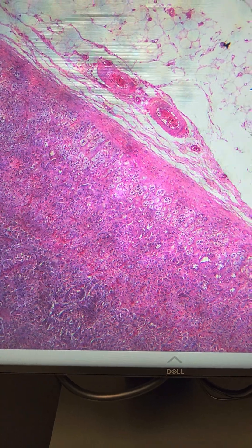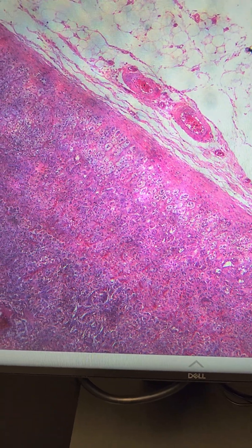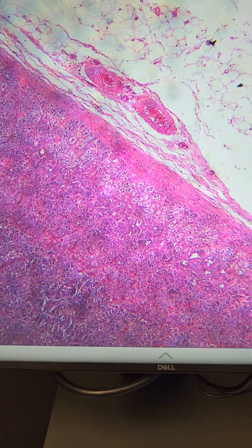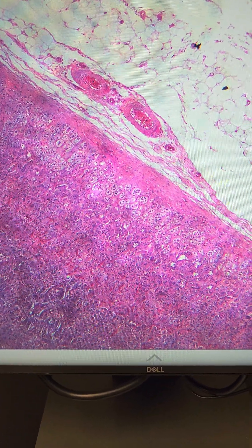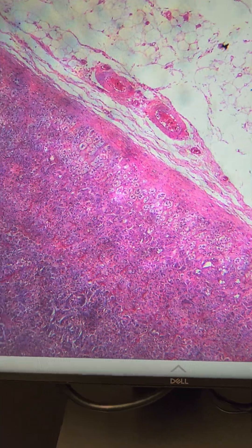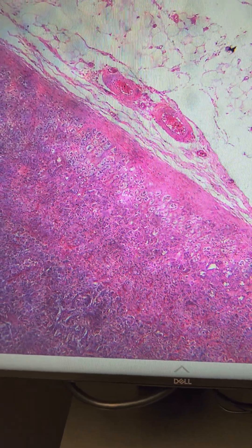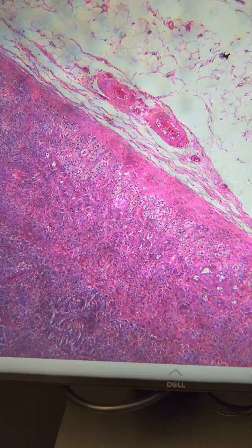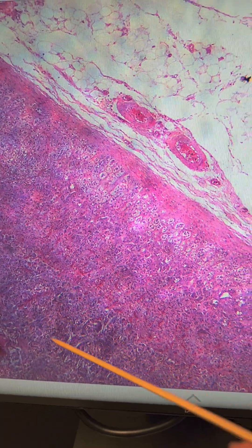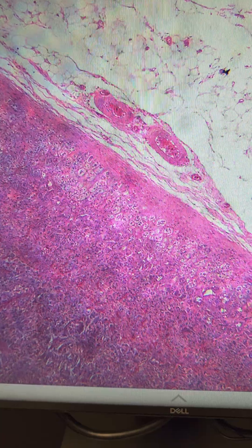This video is the histology of the adrenal gland. Remember that the adrenal glands are also known as suprarenal glands because they sit on top of the kidneys. Like many other organs, the adrenal gland consists of an outer cortical portion and an inner medullary portion. You can see the medullary portion down here, and it produces and secretes epinephrine and norepinephrine.